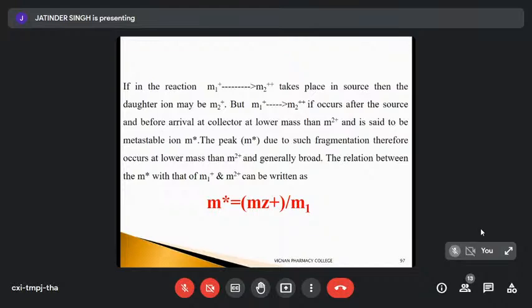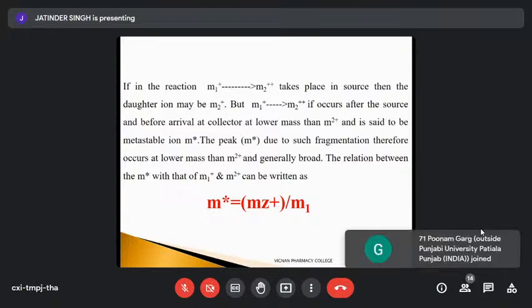The molecular ions which are produced, depending on their movement in the vacuum, get different fragments. You can capture those fragments in a time of flight mass spectrometer. That is, you can work on the different fragments, that this fragment is from this molecule or another molecule. That is, you can go very deep into the molecular characterization.